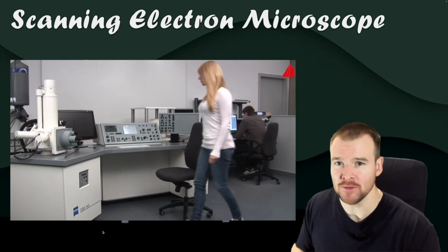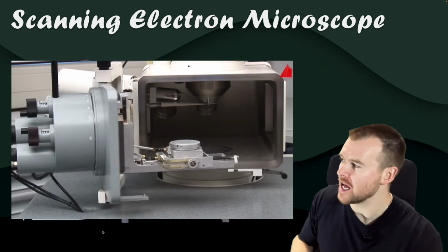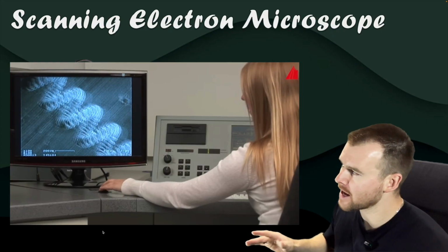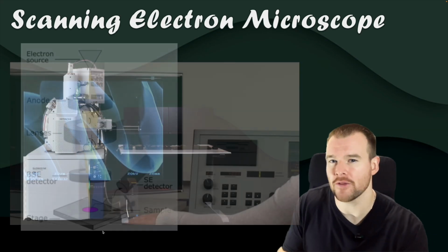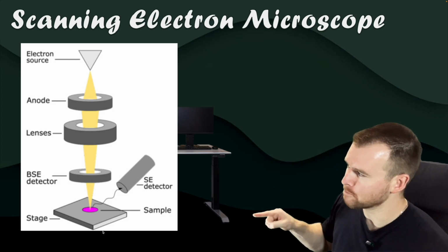The picture looks pretty similar, but instead of this big long column, we have more of a chamber here. And you can see in this video, you can open up the chamber, put a specimen in there, turn on the electron microscope and use its computer to look around, find your specimen, and then zoom in, again, a very big amount. Looking for just a little bit of detail for how it works, instead of passing the electrons through, the electrons are going to bounce off.